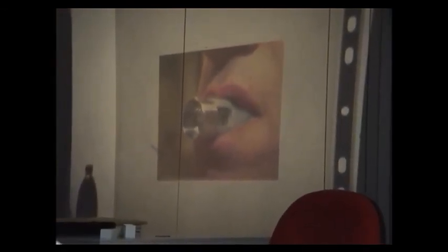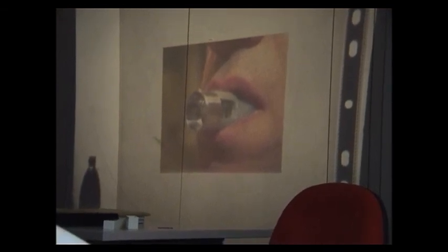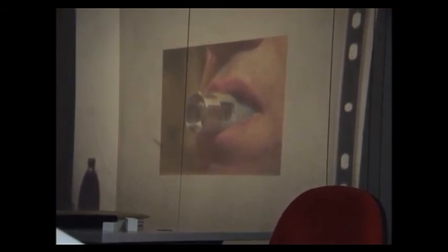And then you see every person has his own system in order to plug to the end of the accelerator in order to irradiate exactly the same position on the teeth during the treatment: just after the fluoride treatment, 1 hour after, 2 hours after, 1 day after, 1 month after, 6 months after, 9 months after.